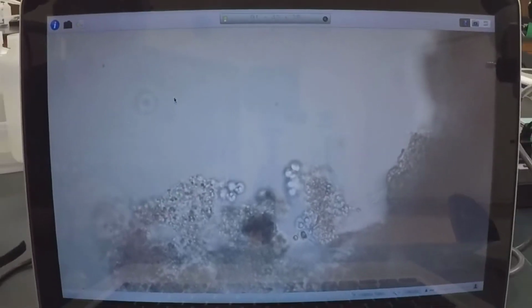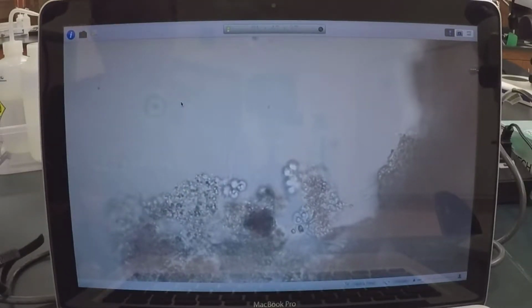A lot of times they're filter feeders, so they'll stick straight up off of vegetation and consume material, but they have the capability of moving the trunk of the body, and there you can see that kind of movement from that stentor. Okay, so we're going to move from pond, and we're going to start examining some other things like bacteria, plant, and animal.